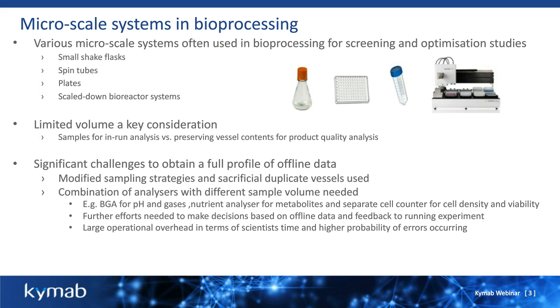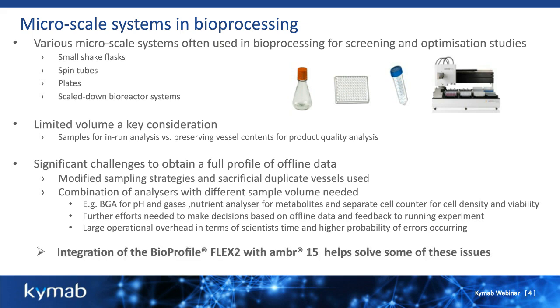Also, further efforts are then needed to make decisions based on this offline data and then feed it back to the running experiment. All of this adds a lot of operational overhead in terms of the scientist's time, and also it has the higher probability of introducing errors. Now, the integration of the BioProfile FLEX2 with the ambr15 aims to resolve some of these issues.